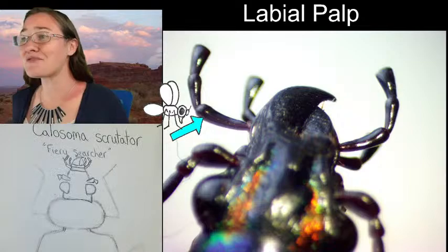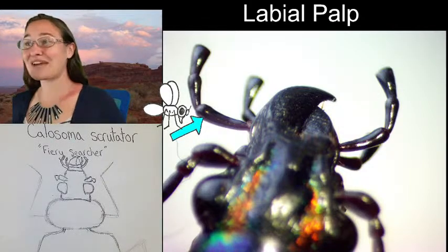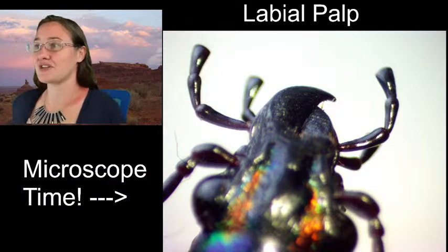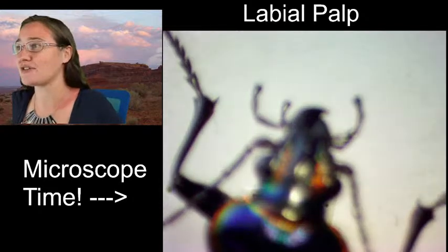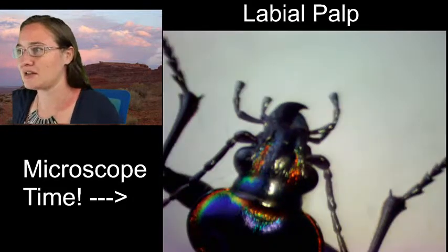All right, so I'm pretty happy with all of that happening on the head. It's a very, very busy head, but you've got all of those different characteristics, and they're all helping this beetle survive, right? They're all adaptations that are useful for my specimen.